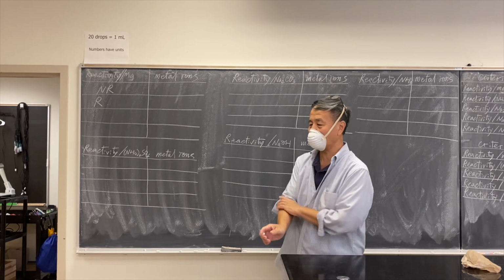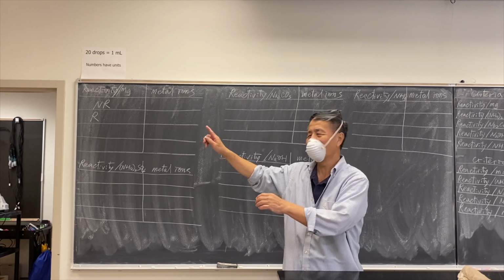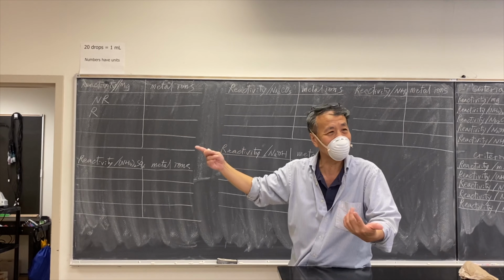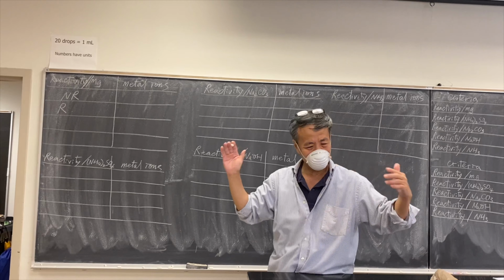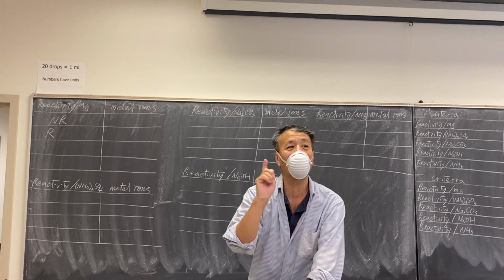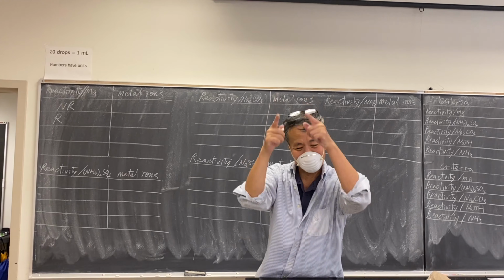Now the other question students ask is, can I have reaction first and no reaction second? Yes, you are the one dealing with the data, you are the one who makes the decision. However, in science, we always say, do it methodically, do it in a sequence.